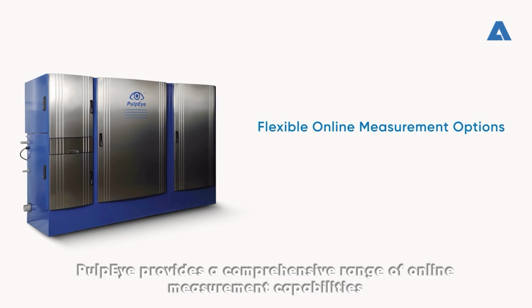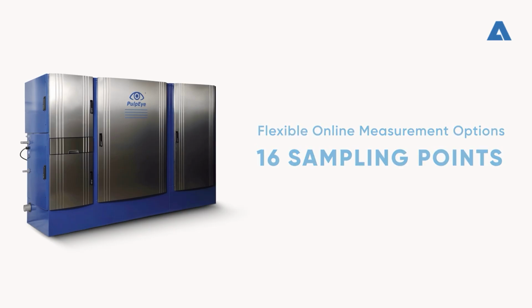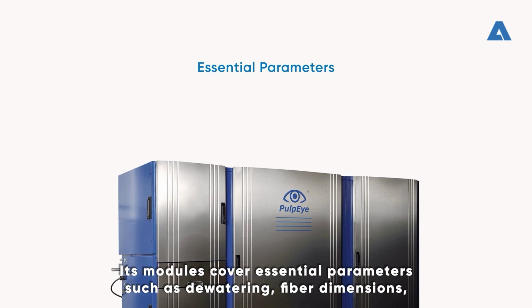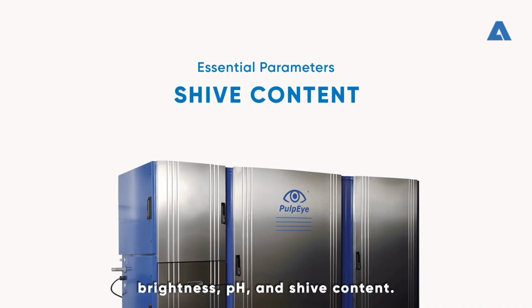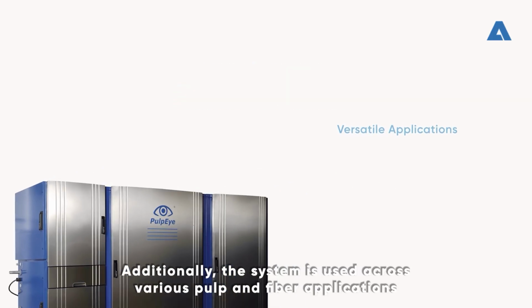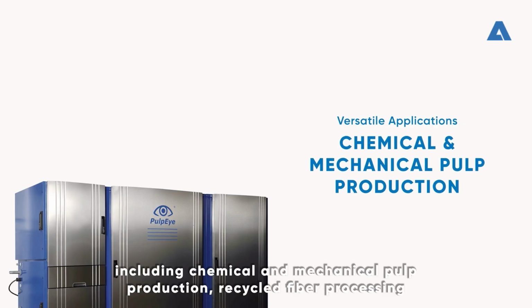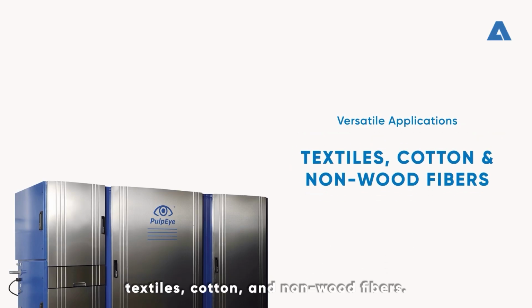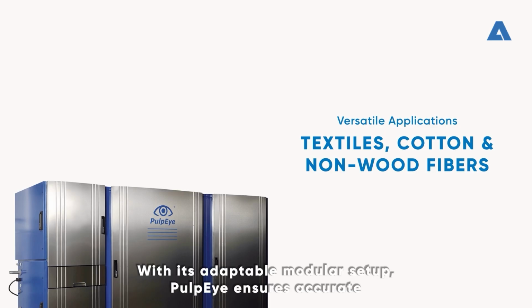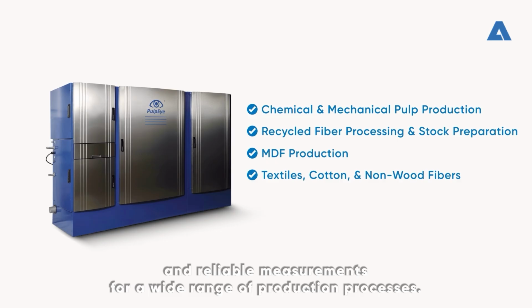PulpEye provides a comprehensive range of online measurement capabilities, supporting up to 16 sampling points with options for manual collection via RMI and LabEye. Its modules cover essential parameters such as dewatering, fiber dimensions, brightness, pH, and Shive content. Additionally, the system is used across various pulp and fiber applications, including chemical and mechanical pulp production, recycled fiber processing and stock preparation, MDF production, textiles, cotton, and non-wood fibers. With its adaptable modular setup, PulpEye ensures accurate and reliable measurements for a wide range of production processes.